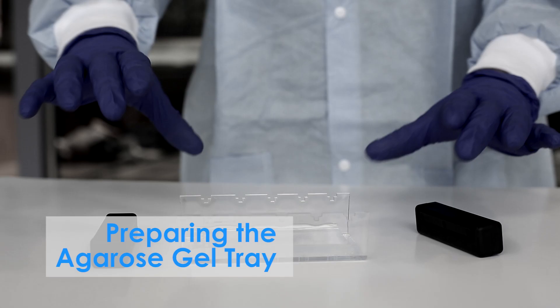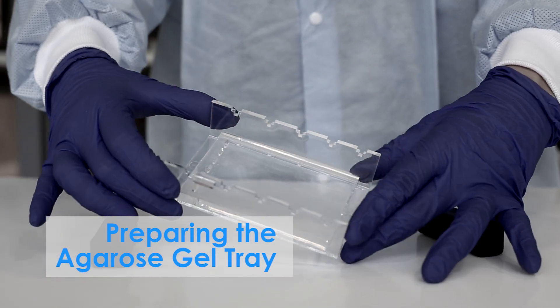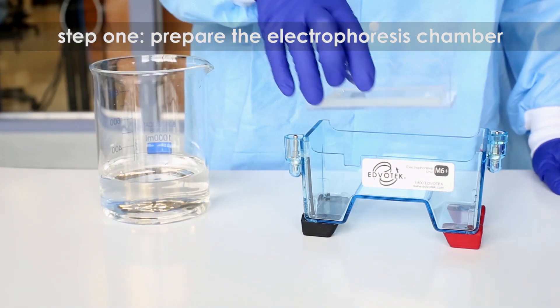Edvotek instructional videos: performing electrophoresis. In this video we're going to perform electrophoresis in five easy steps. Watch our video preparing the agarose gel tray. Before starting this experiment, step one: place the gel tray into the electrophoresis chamber.